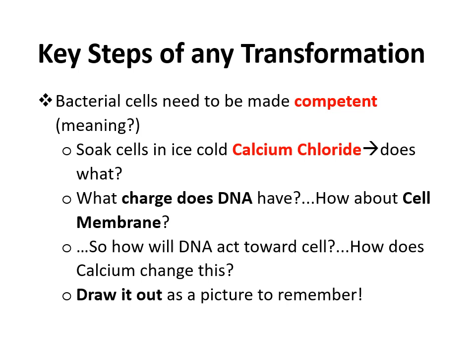And on the next slide, I want you to circle, star, highlight that. Okay, so pay close attention to the picture on the next slide and make sure to draw it out just like I do to help visualize it, because this concept of competency, calcium ions, negative DNA, negative bacteria, this always comes back in the post labs, in the quizzes, in the final, in various other places. And like I said, this comes back in later semesters when you take other science labs.